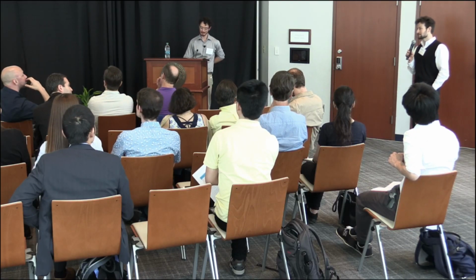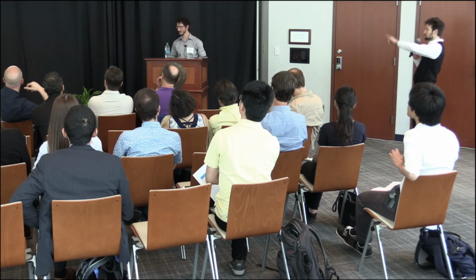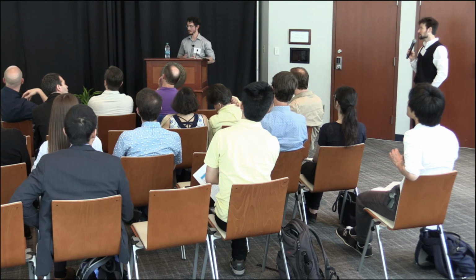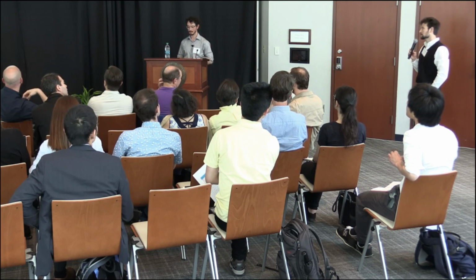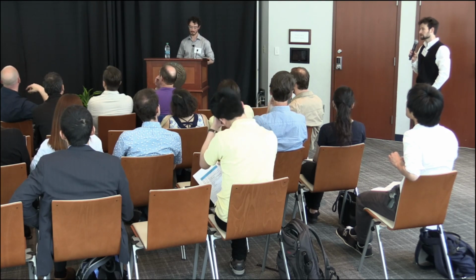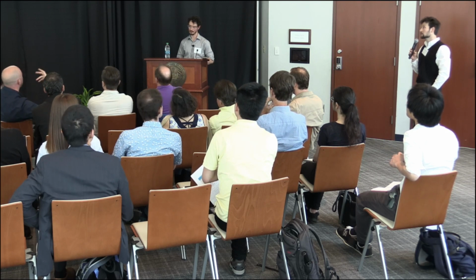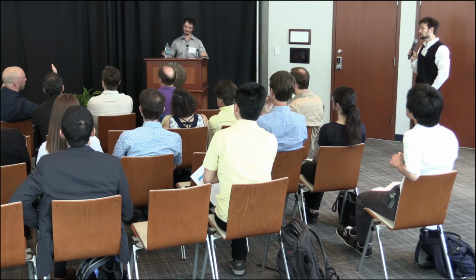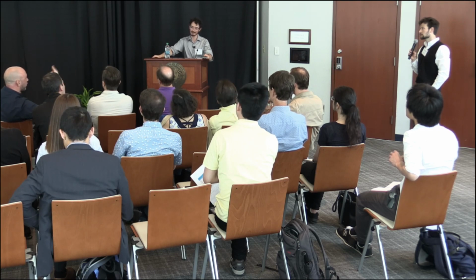Now, before I give the microphone, I have a comment to the question that Sam asked. So I think that the difference is there. You can see it in the color map, but that's why I prefer to look at those distributions. If you actually look at the correlations within each distribution, the difference is very small, and some of that can be just stochastic variation. But you're also saying that that's not significant. That's right. So, pretty close. 0.07 is pretty close to the arbitrary cutoff anyway. So I mean that one could consider those different, right?